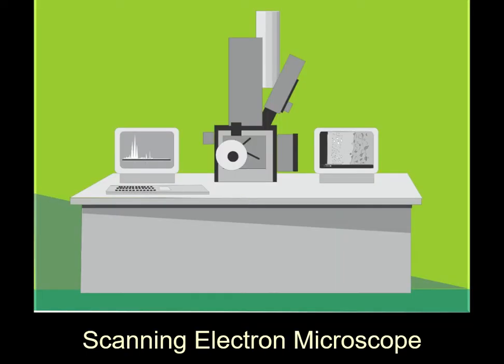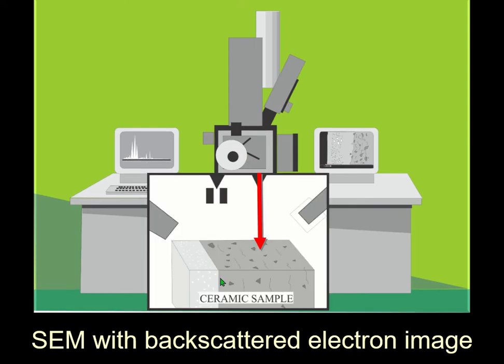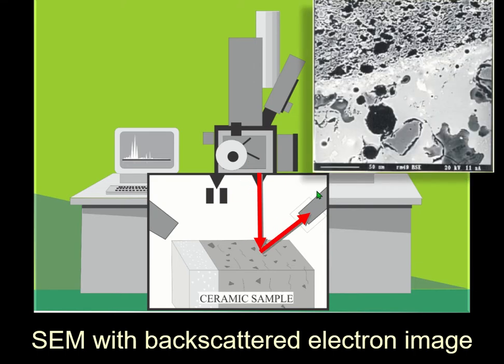So you actually can't see luster paint through a scanning electron microscope, because it's very, very thin. It's like angstroms thin, molecules thin. But there are other things that you can see with a scanning electron microscope. It's very useful. You stick a sample in here, which is a ceramic sample, and you can do imaging using backscattered electrons, which get collected up here, and this is an image.